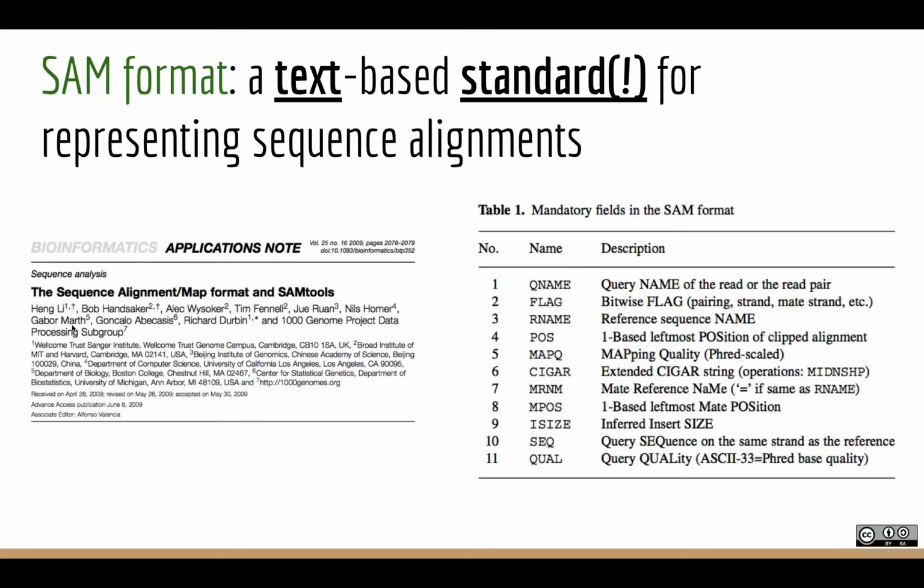So a couple of things about this. Prior to 2009, so around 2007, I think, the 1,000 Genomes Project was kicked off. And it was hugely ambitious. Okay, we're going to use this cool new Illumina sequencing technology to sequence 1,000 genomes. Actually, they ended up sequencing 2,504. But the idea was to use that whole genome sequencing data from all these individuals to characterize the vast majority of relatively common genetic variation that exists across humans throughout the world.